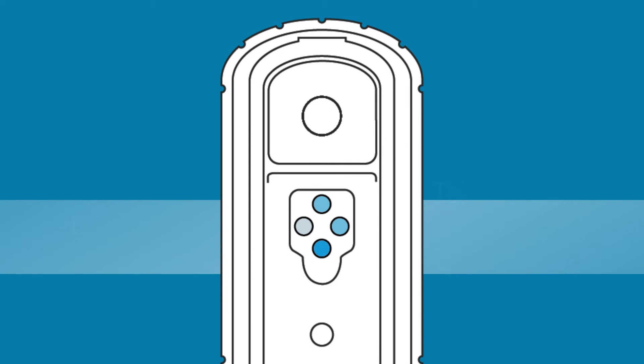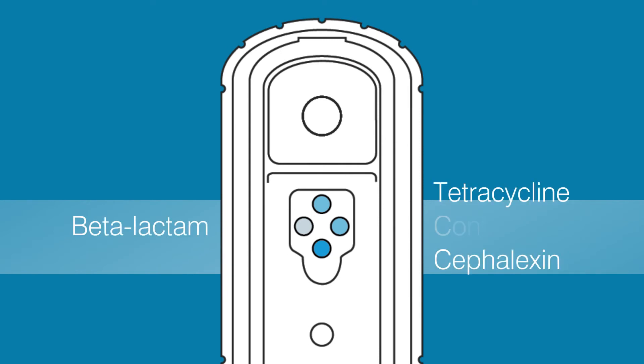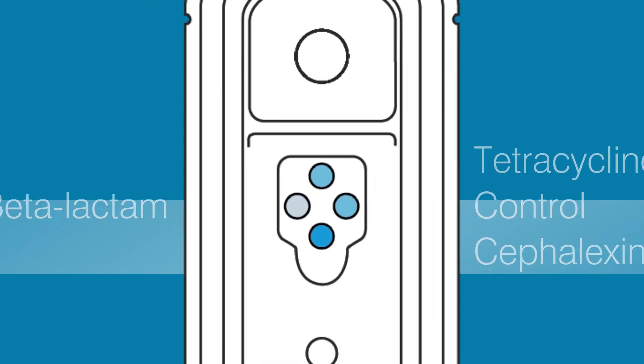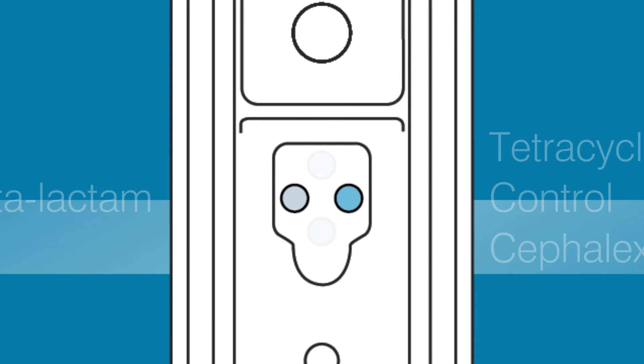After six minutes, compare the sample spots to the control spot. If a sample spot is lighter than the control, it's positive for antibiotic. If a sample spot is the same color or darker than the control, it's negative.